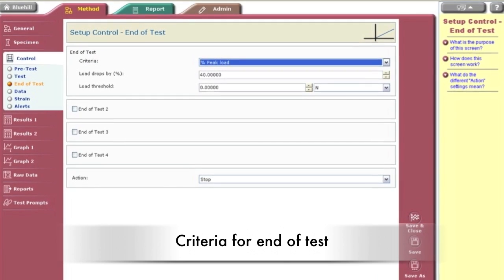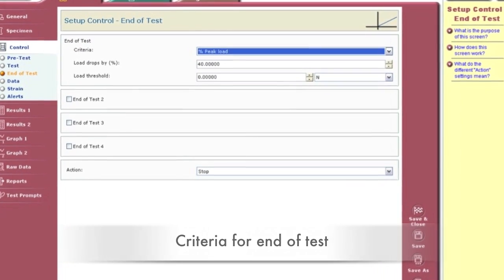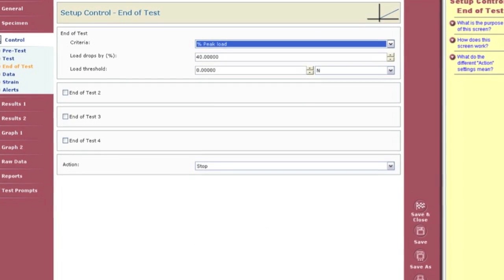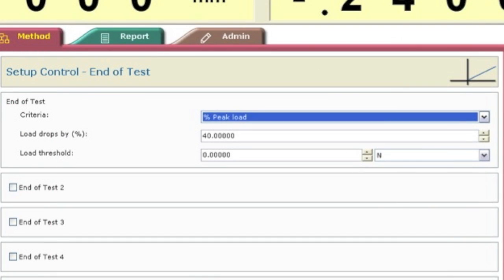The end of test tab identifies the criteria for the end of the test. A large load drop is experienced when sample failure occurs. For this test, when the sample load drops by a certain percentage of the peak load, the machine will stop. This percentage depends on the type of sample.